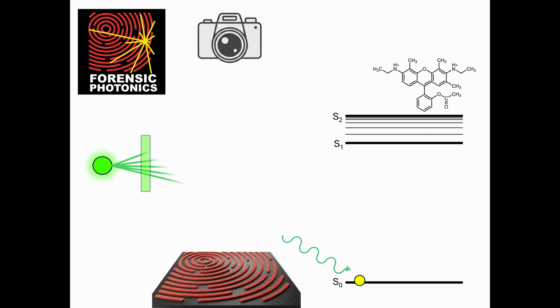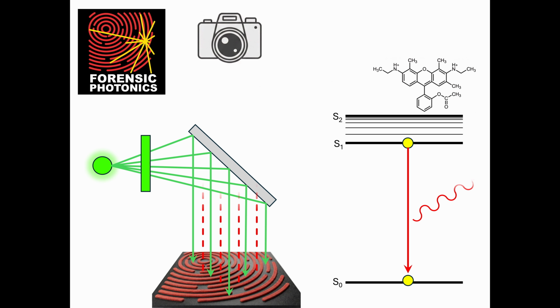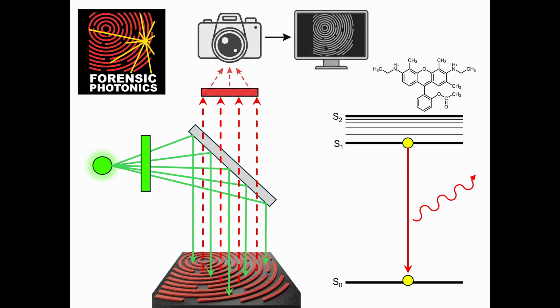Jablonski described this in a visual representation, now known as the Jablonski Diagram. This diagram depicts electron transitions during the fluorescence process, beginning with excitation by the excitation light. Then there's this vibrational phase. This is a settling of the electron orbit to the S1 excitation state after being violently impacted by the photon. This vibrational settling results in a small energy loss as heat. When the electron relaxes to the ground state again, the energy it must shed is less than the energy it absorbed, owing to the small amount of energy lost as heat.